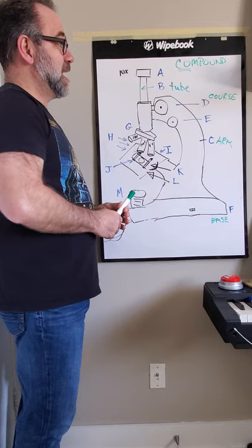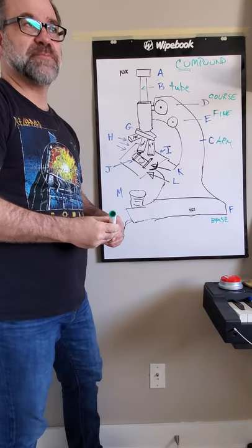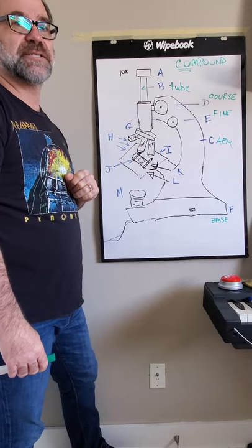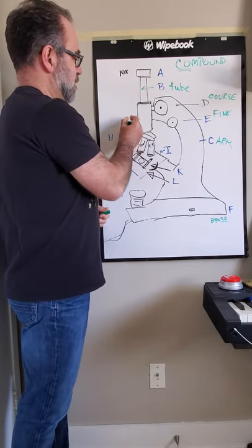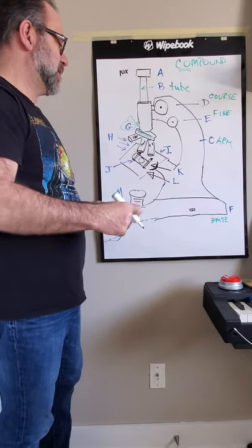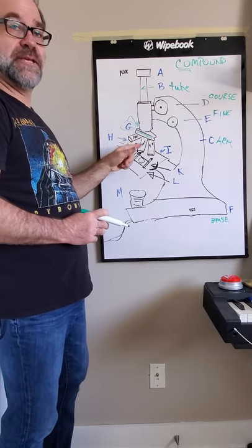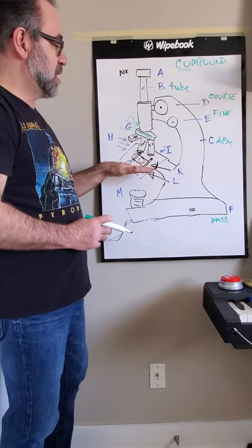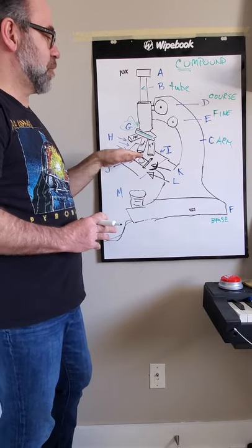That's where we always start. The second one, the smaller knob, is called the fine adjustment knob. What that will do is it will bring things into focus, and that's the one that you use with all three of the different lenses. So once you've found your target, you can turn the revolving nose piece, which is right here, and that will allow you to change the objective lens that you're looking at. Then you can use the fine adjustment knob, not the coarse adjustment knob. We want to avoid using the coarse adjustment knob when the medium or the high power objective lenses are in play because we can crack the lens or scratch the lenses by lowering and raising the stage if we're using the coarse adjustment knob. We want to avoid that to keep from damaging or scratching the lenses or cracking the slides.